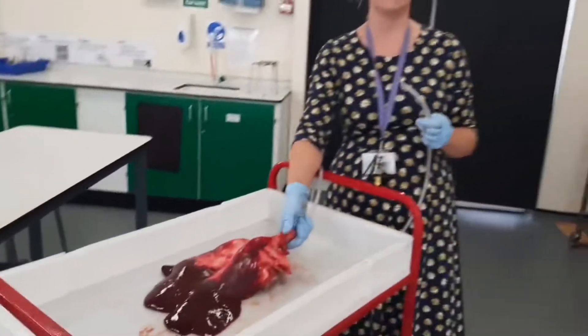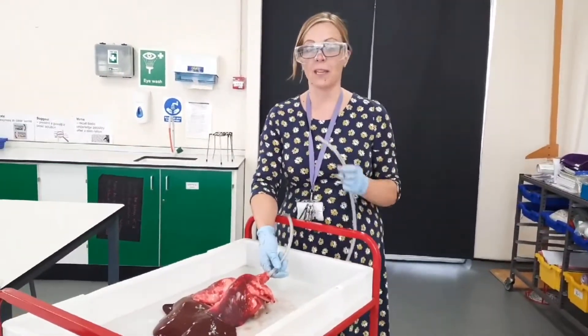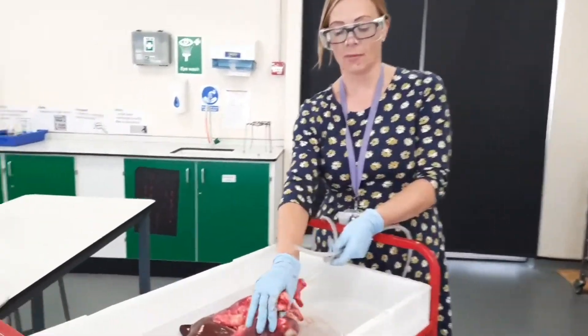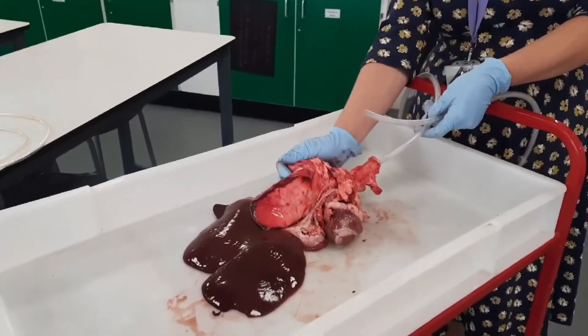So as you can see, our lungs are able to expand much more when they're filled with air. Also interestingly enough, the lungs have the heart underneath them and that's what we're going to do next.